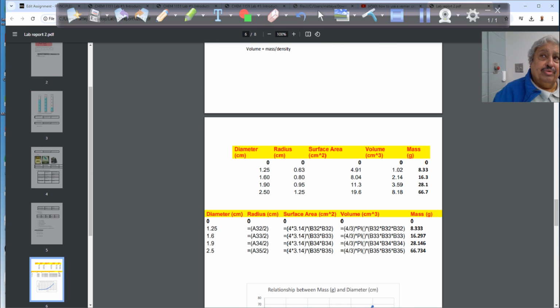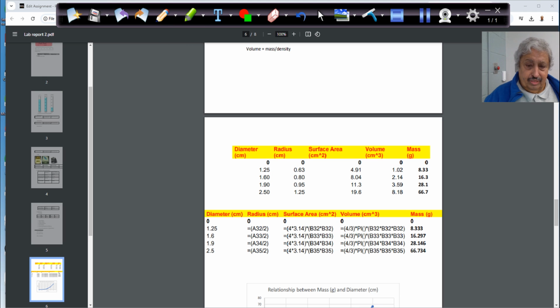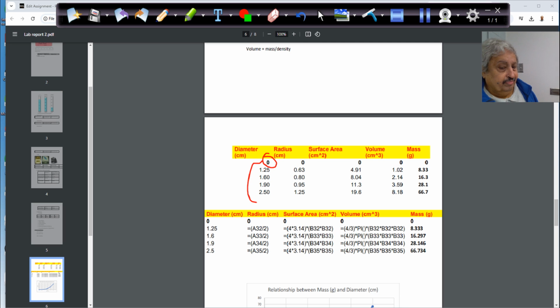So here it is. We have the first one here. The students measured the diameter. You start with the 0, of course. 0, 0, 0, 0. These are your coordinates. And then you have 4 balls here. That's the different diameter measurements with the vernier tool.